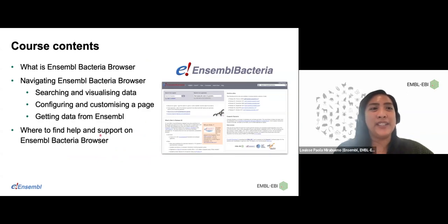So today, I hope that at the end of the webinar, you'll know what the Ensembl Bacteria browser is all about, what type of data you can find on there. We're mainly going to show you how to search and visualize genomic regions in the Ensembl Bacteria browser, how you can add tracks to the region in detail view, and also look at gene data. And most importantly, I'll also point out where you can find help and support if you need some later on when you're browsing Ensembl Bacteria in your own time.